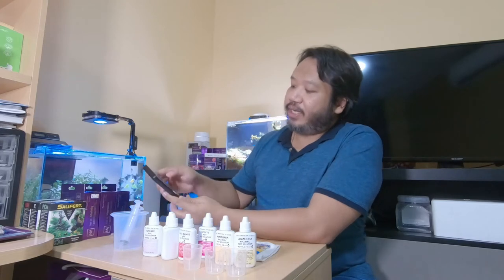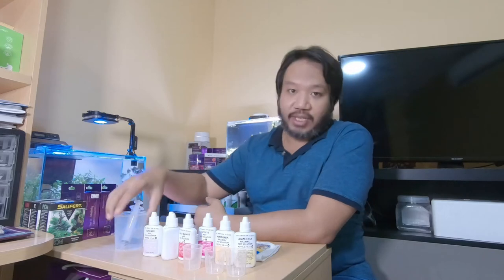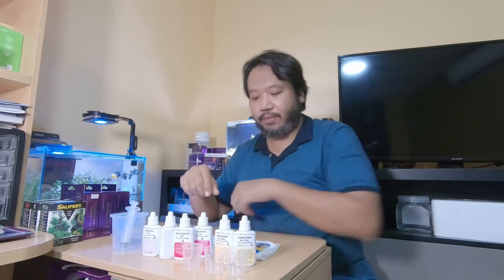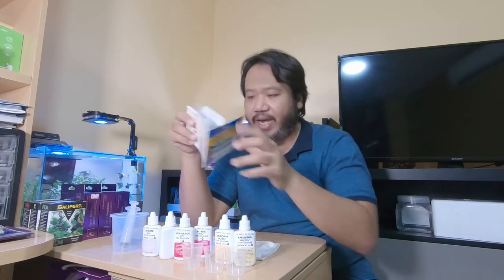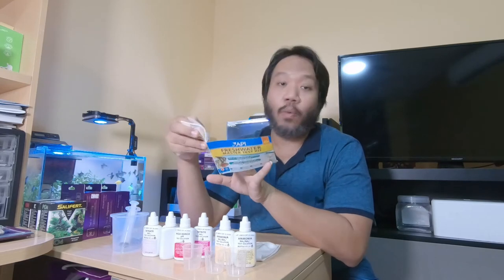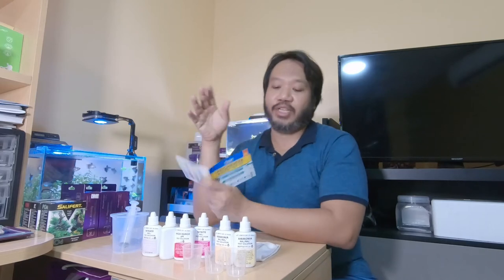I also have a timer here. I don't normally use a timer, but for testing purposes I'll show you, because some tests require a specific amount of time and a specific number of shakes. Let's go through the manual. For pH testing, it tells you why pH matters — it's the measure of acidity in the water. Basically it's not just about measuring pH, it's about maintaining it.